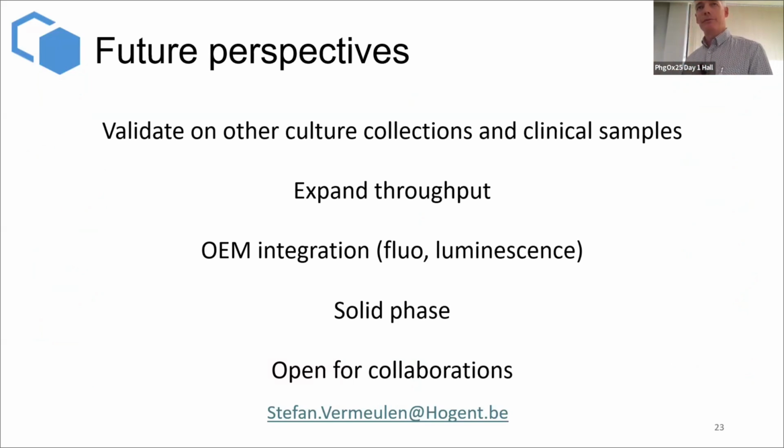You already saw people do more rapid tests, but we specifically designed now for a universally applicable machine, because whenever you go to fluorescence, it will end up in a lot of optimization for a particular strain, and that can be done. It's not a problem at all to change the imaging system in our design.